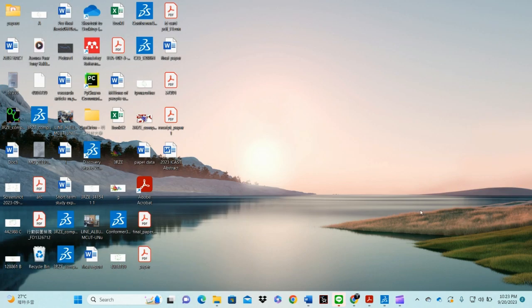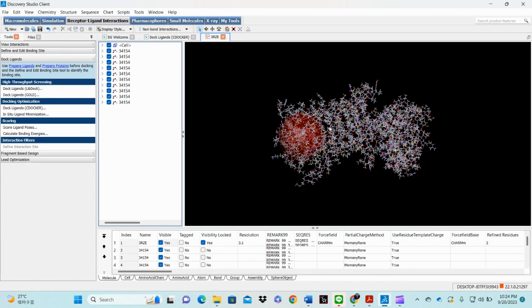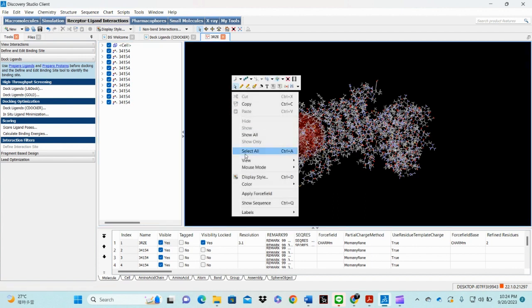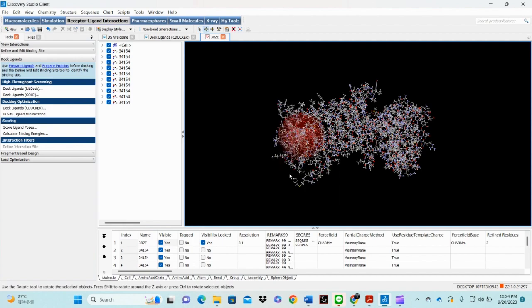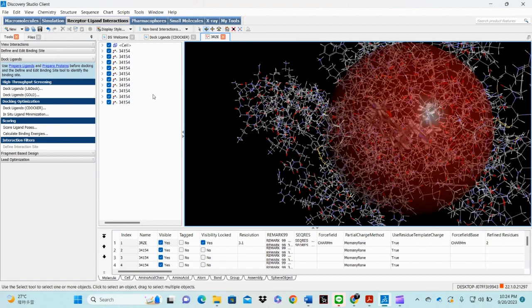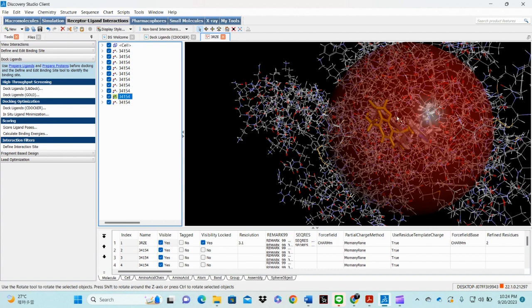In this video we will learn how our drug molecule will show interaction with our protein active site. In the previous video we saw how a molecule interacts with a ligand molecule through the molecular docking process. When molecular docking is complete, we can see how many interaction residues are present between the binding site of the protein. Here you can see the binding ligand, drug phytochemical, inside the active site. If we want to see a specific ligand in 2D form in the active site of our receptor molecule.